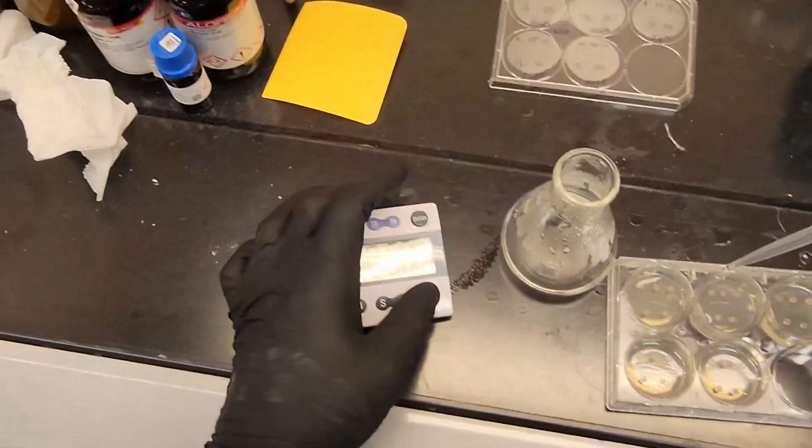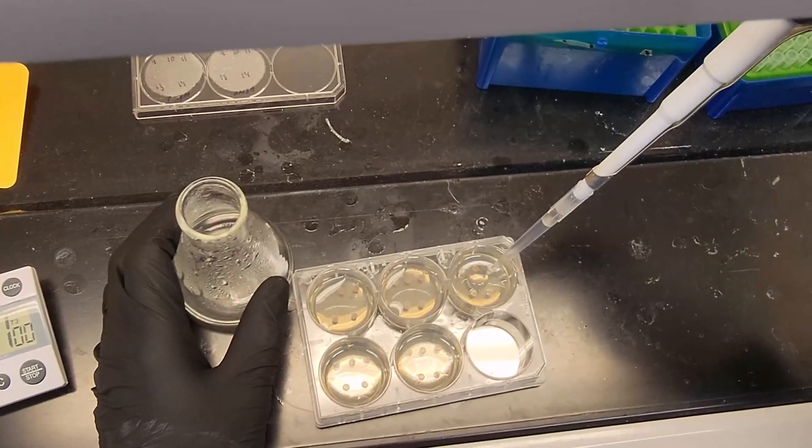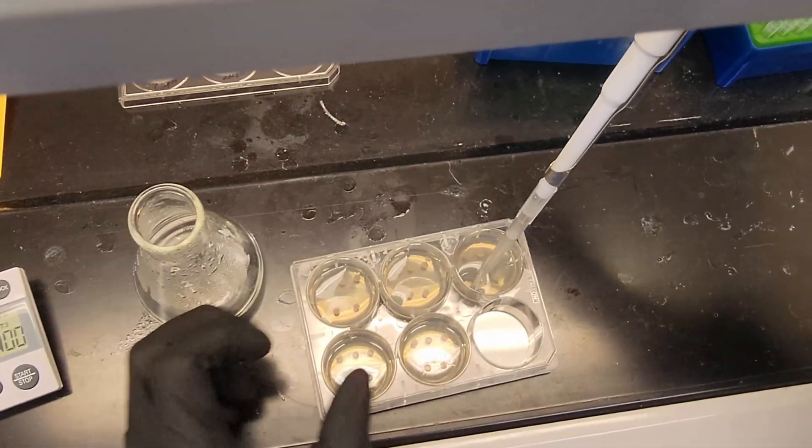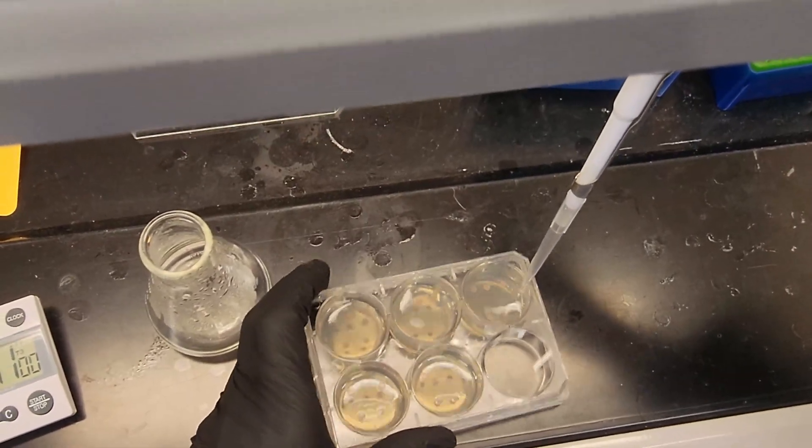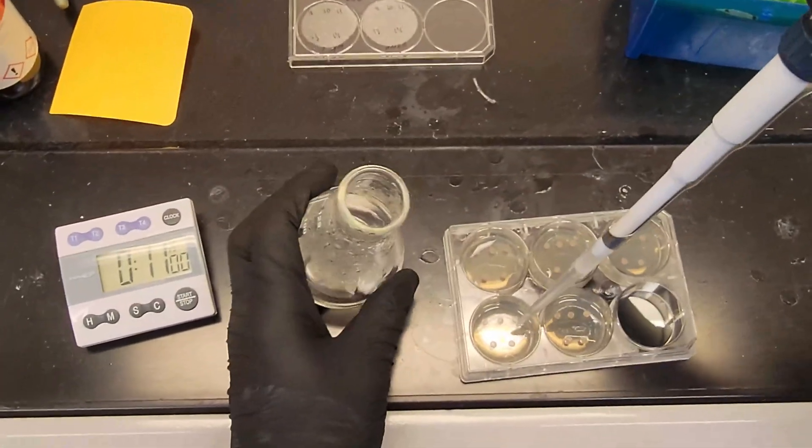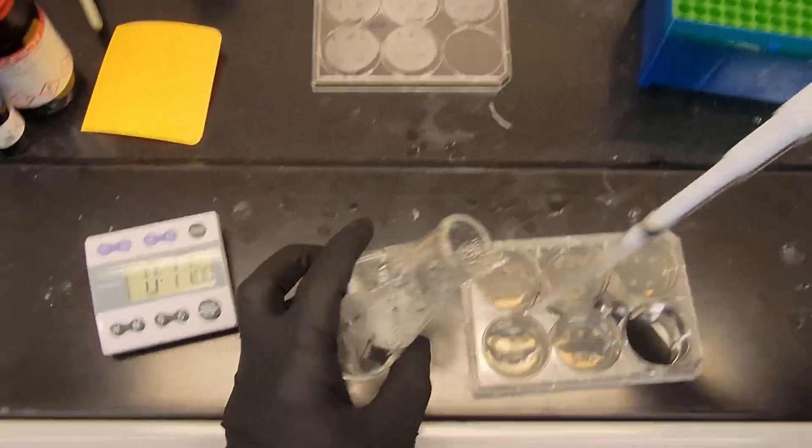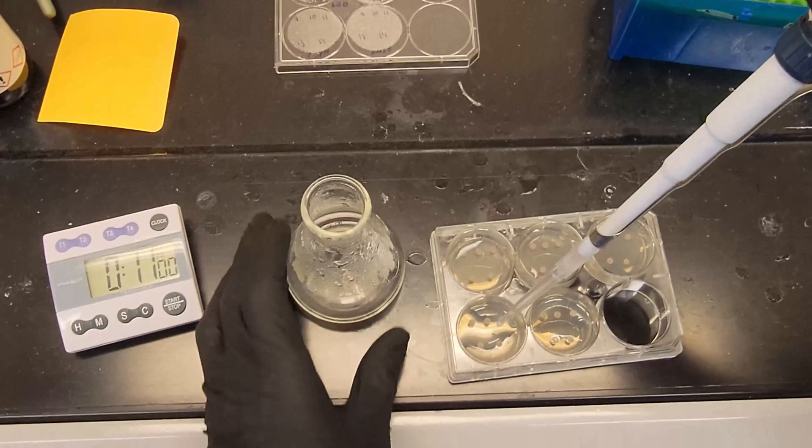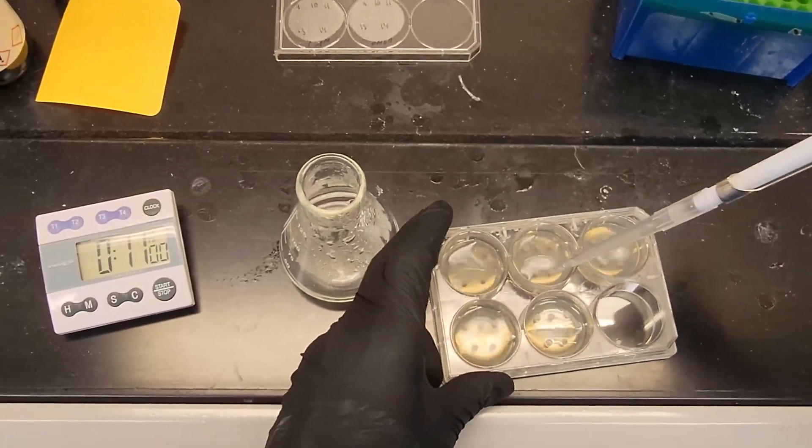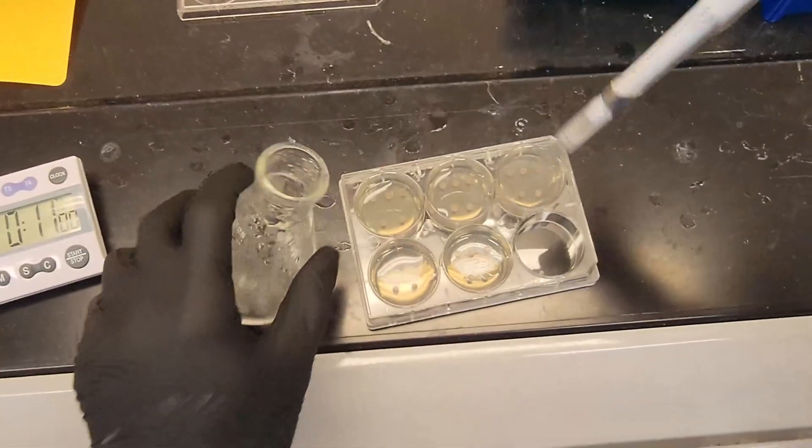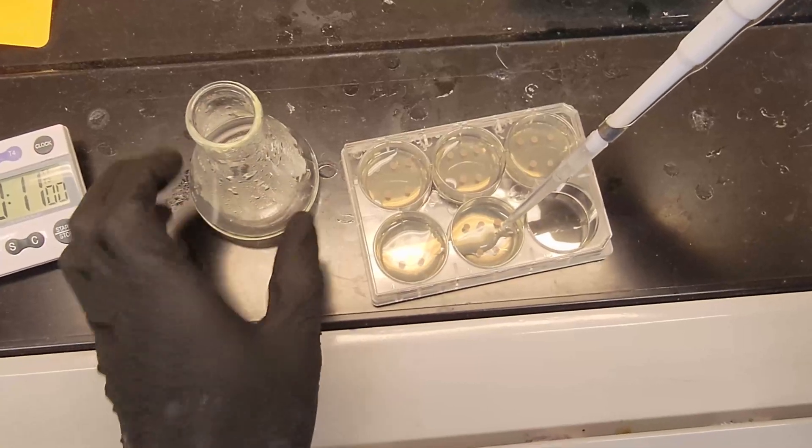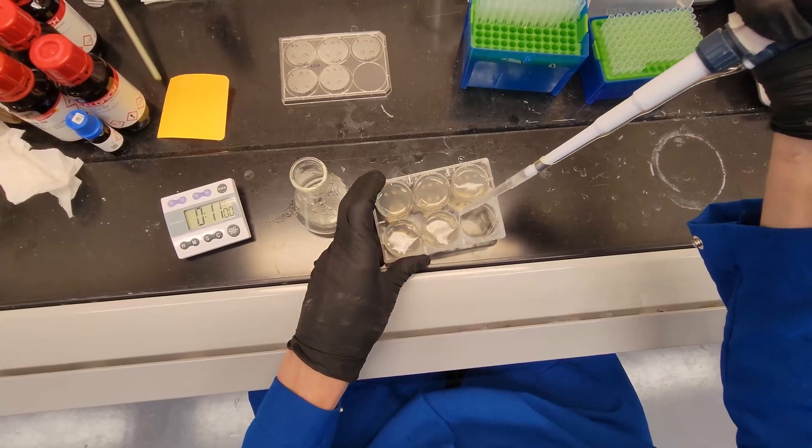That timer scared me. Okay, okay, stop. Yeah, so, you know, this needs to be warm while it's adding on so it doesn't set. But when you add the chemical, you don't want it to be too hot. So it's like a warm or like a hot cup of coffee is sort of the max temperature you want it to be before you add the X-Gal and the BME. So I'm adding the agarose solution and swirling it around. That's it.